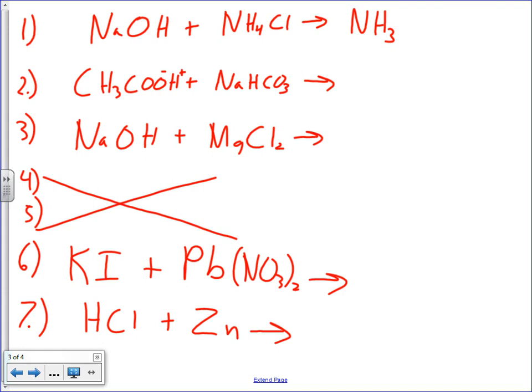Ammonia is one of the gases that was produced. And in this one here, this isn't much of a hint because as soon as I write it down, you'll go, oh yeah, I knew that. The gas produced in this one is carbon dioxide, and there are 3 products in that one as well. So there are 2 more products in each of those reactions after those gases. So we've got this plus something else. I want you guys to use your resourcefulness to figure out what they are, and then balance those reactions correctly.